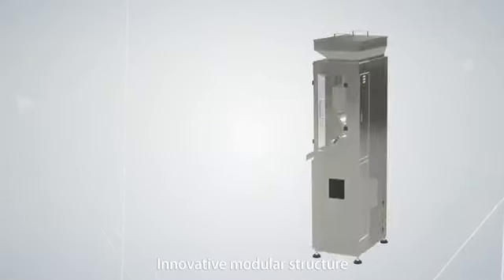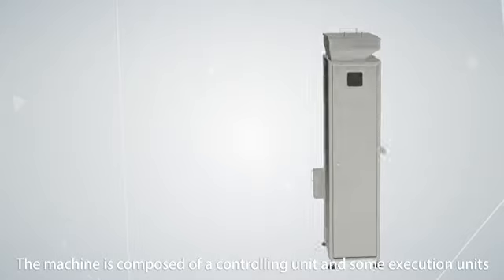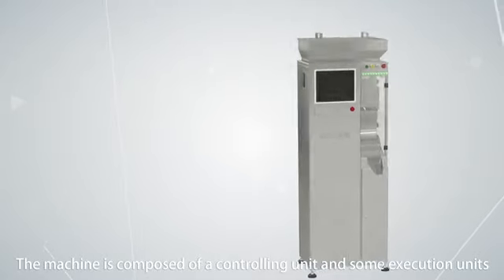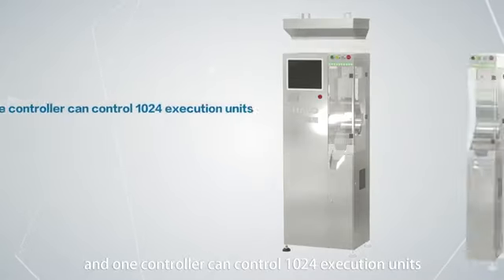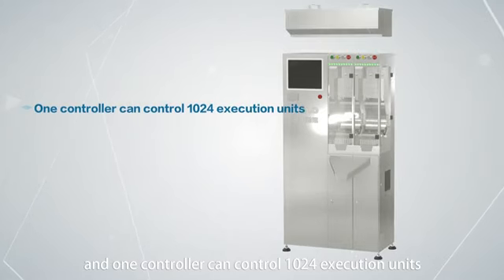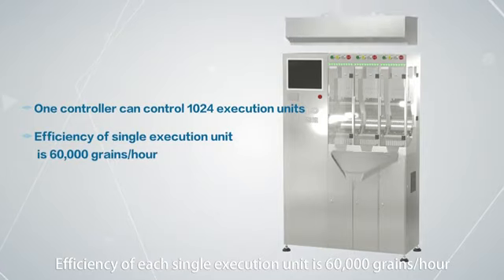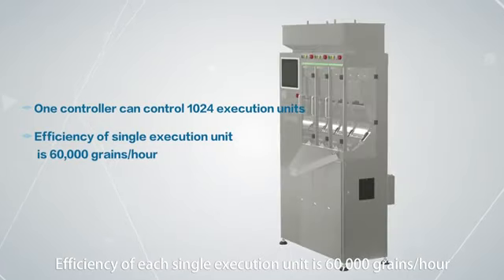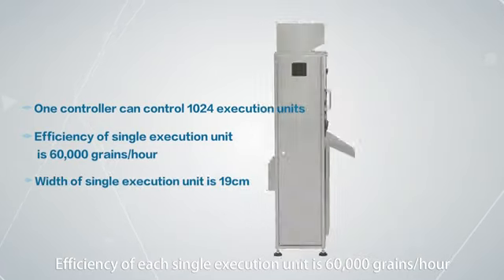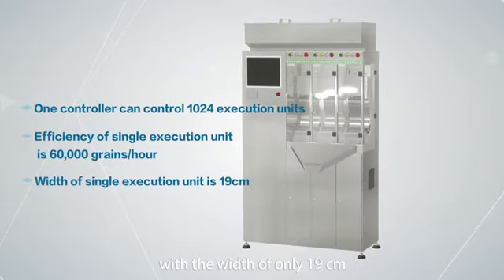Innovative modular structure, the machine is composed of a controlling unit and some execution units, and one controller can control 1024 execution units. Efficacy of each execution unit is 60,000 grains per hour, with a width of only 19 centimeters.